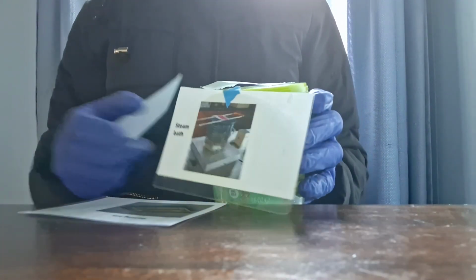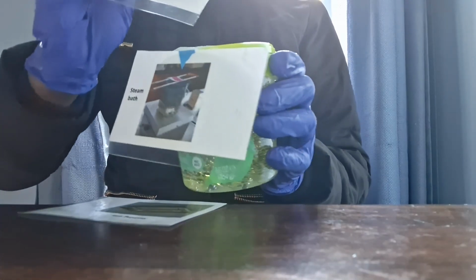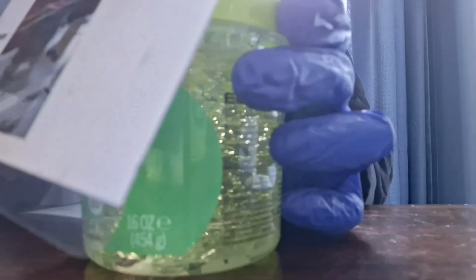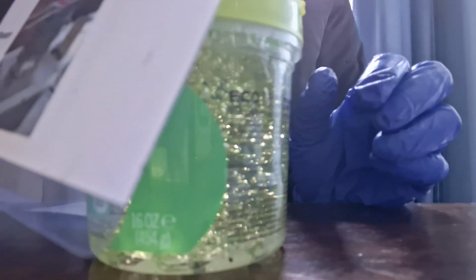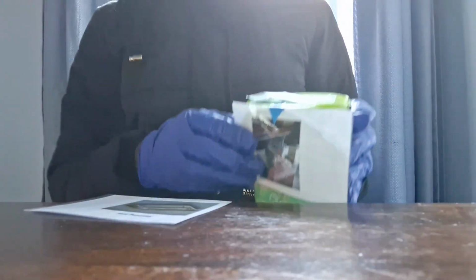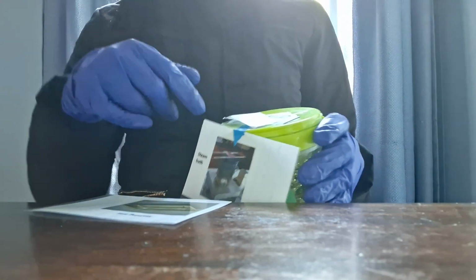Heat opens the pores up, so we put some drops of malachite green on it, then let it sit. After we've added the malachite green, we'll let it sit for 10 minutes because the heat will open up the pores so that the malachite green can penetrate into it.